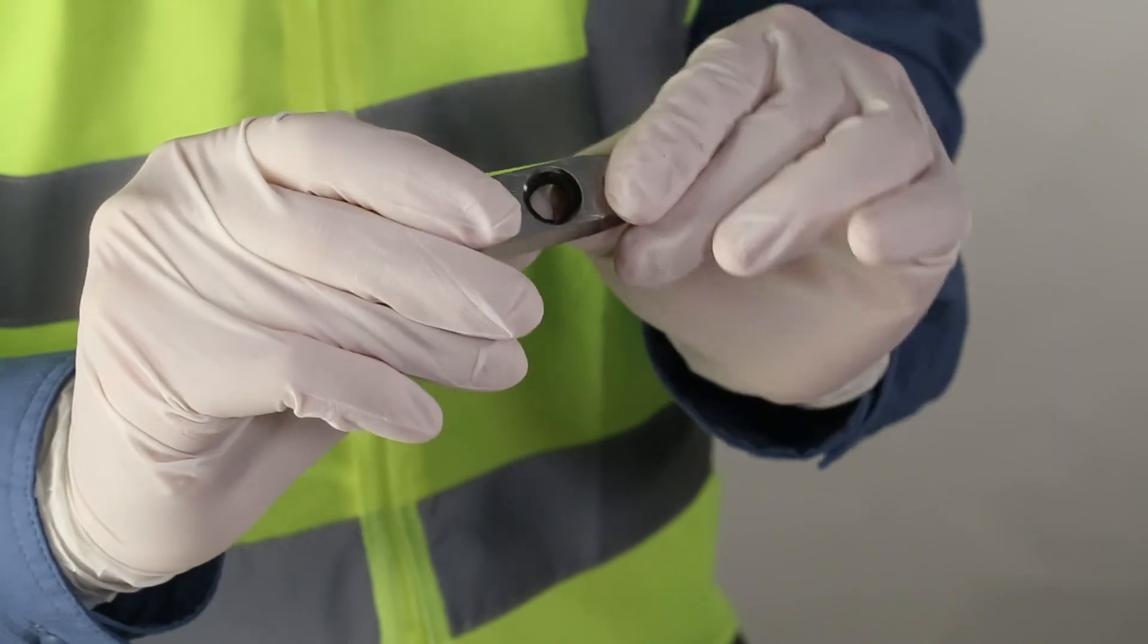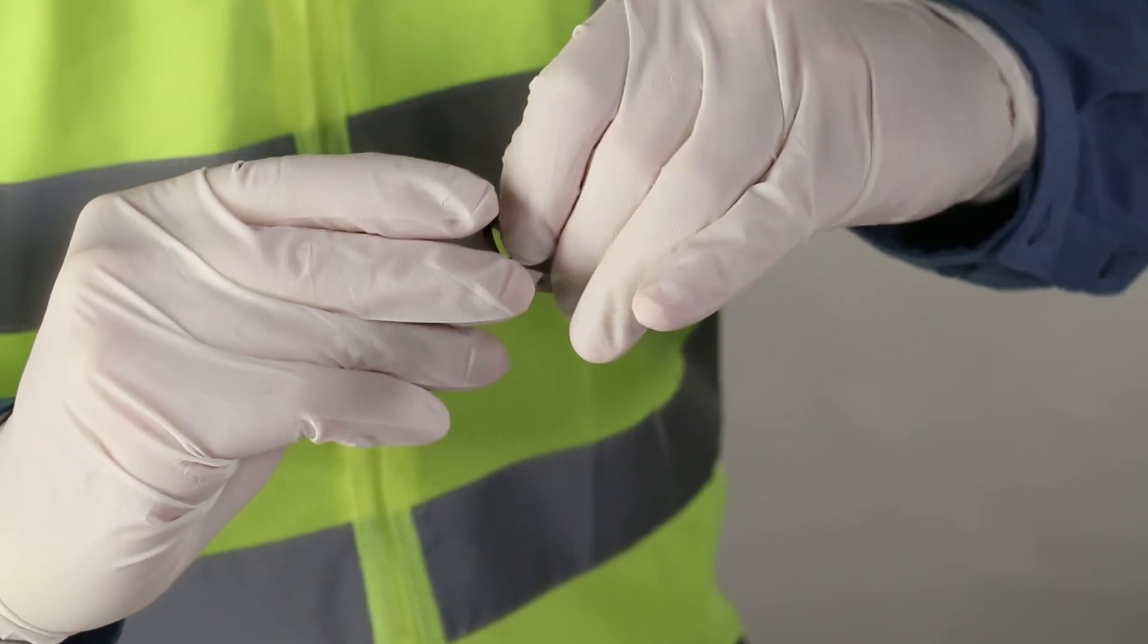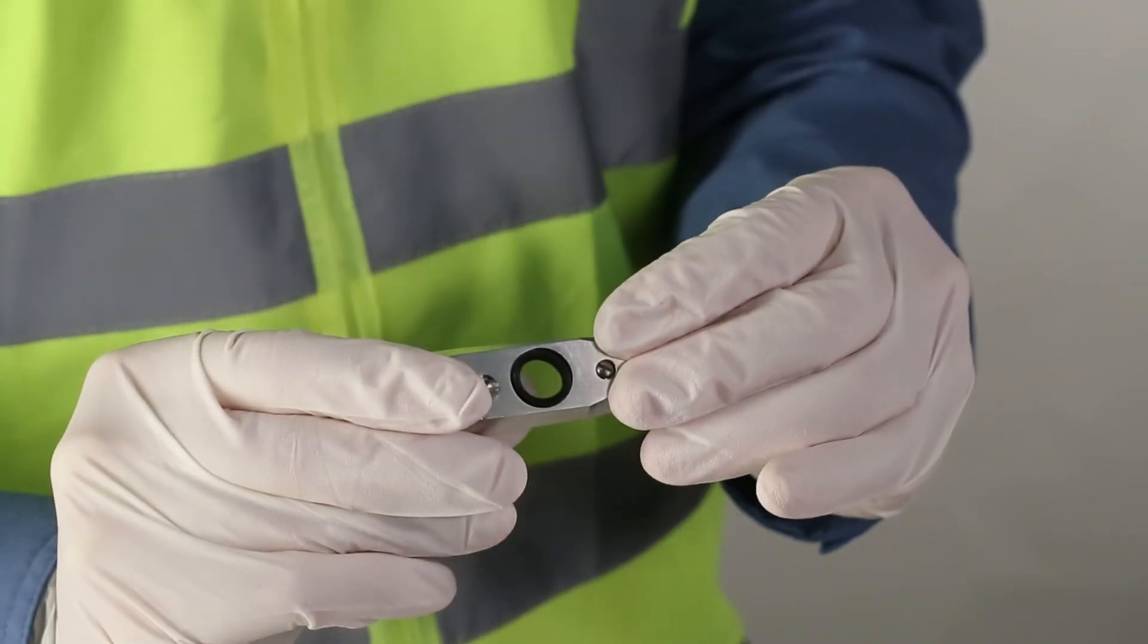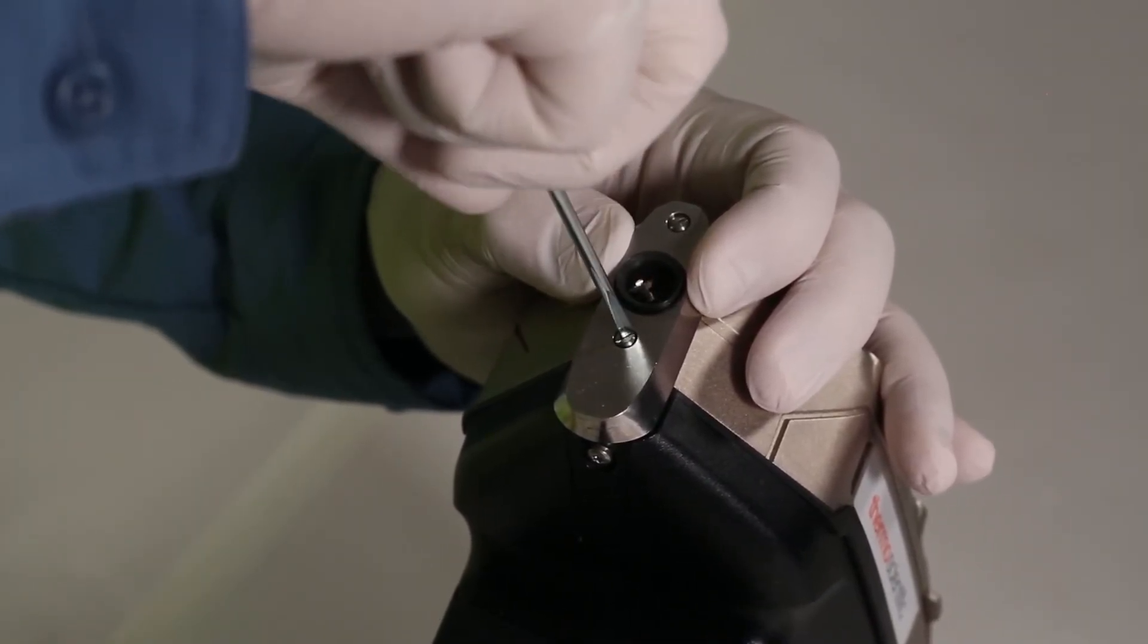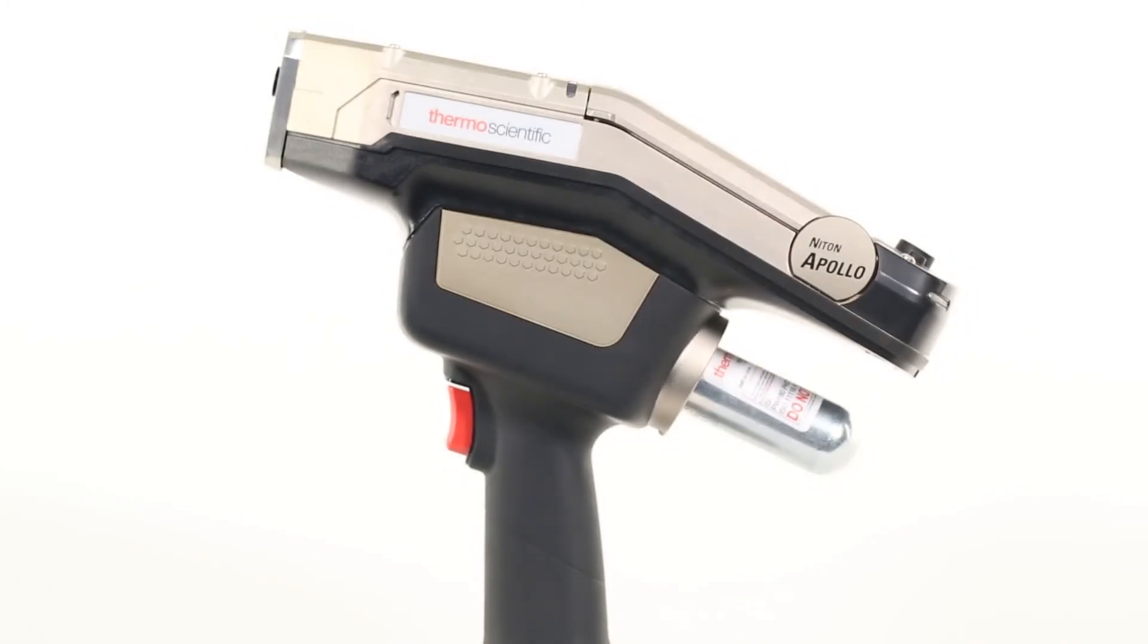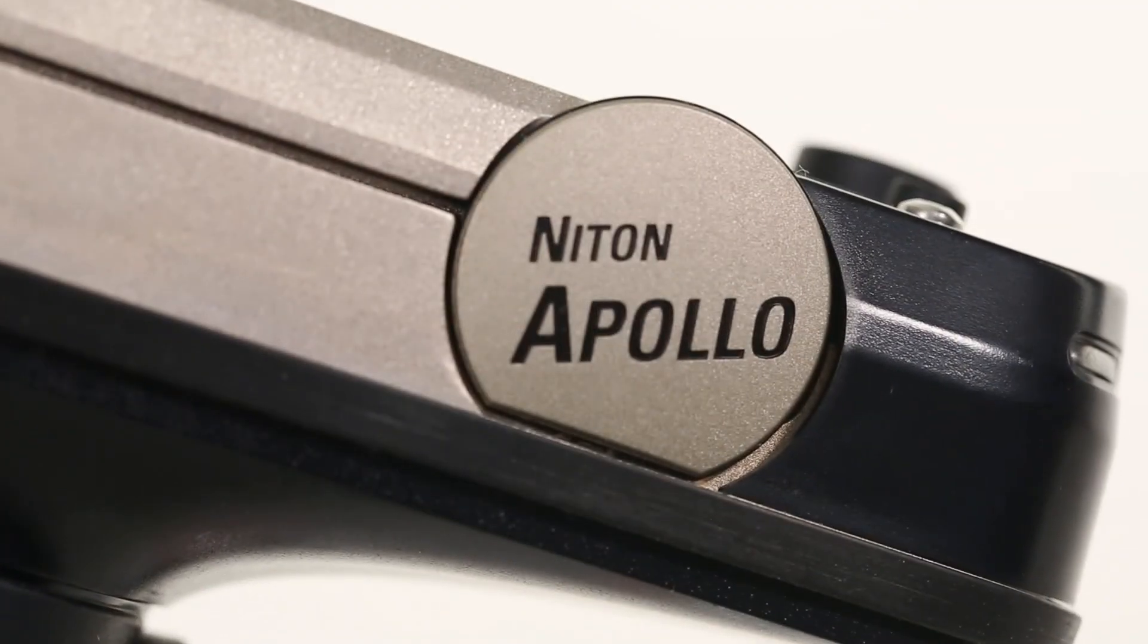If your nose seal appears damaged or frayed, continue by replacing the nose seal. Complete the cleaning procedure by using a flathead screwdriver to securely fasten the nose piece. You have now successfully performed instrument cleaning on the Niton Apollo LIBS Analyzer.